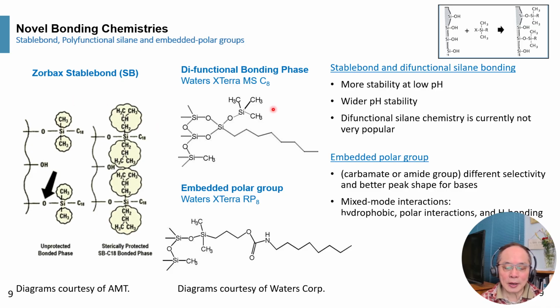Okay. Also, in the late 90s, there was the development of these phases, which is difunctional bonding chemistry, where one used a trichlorosilane.